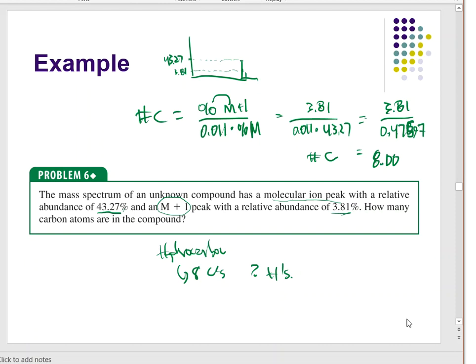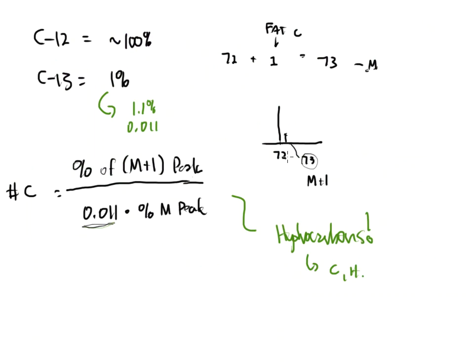But it's an equation. It helps us get another piece of the puzzle. It helps us to maybe narrow down some of the choices that are there. And this is one of the powerful things about the isotope peaks that I will see in a mass spectrum. Okay, with that said, this is called the M+1 peak, right? I could see a little bitty peak beside that one. Where's that coming from? We call that an M+2 peak.